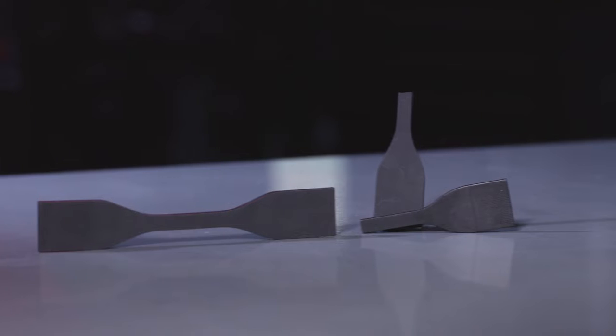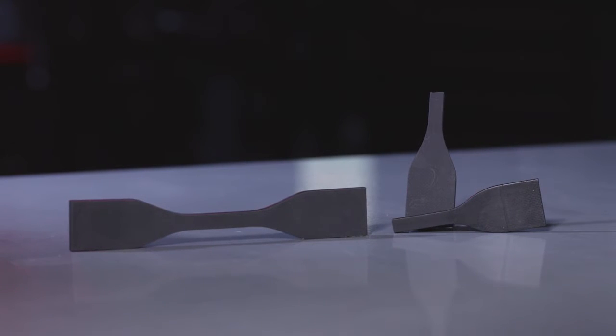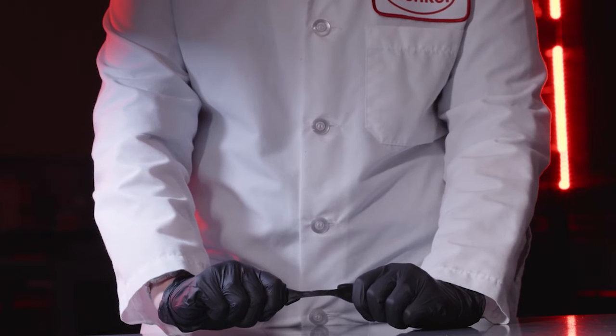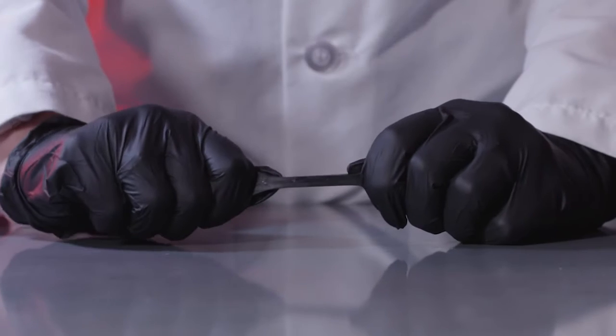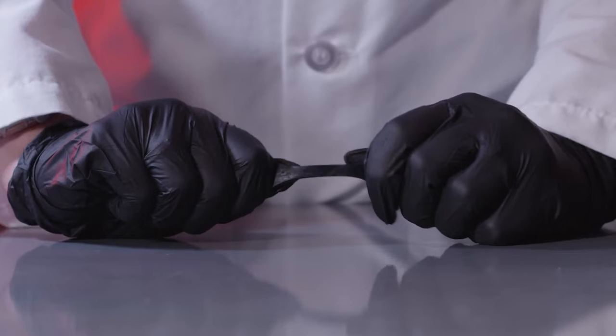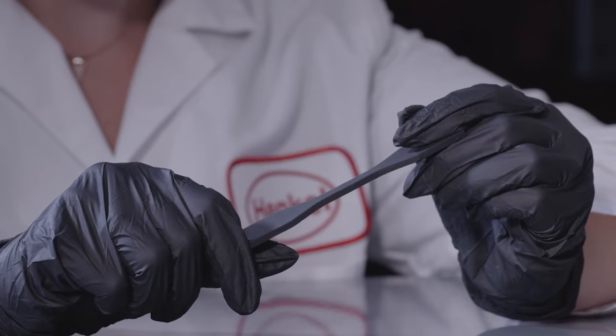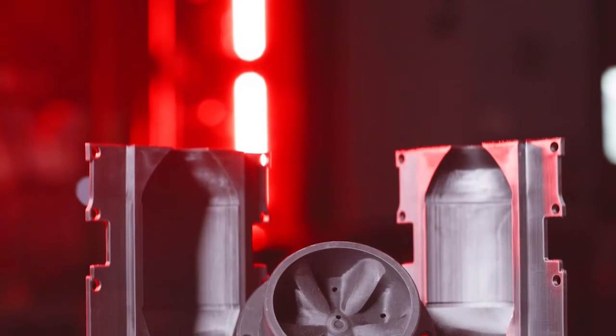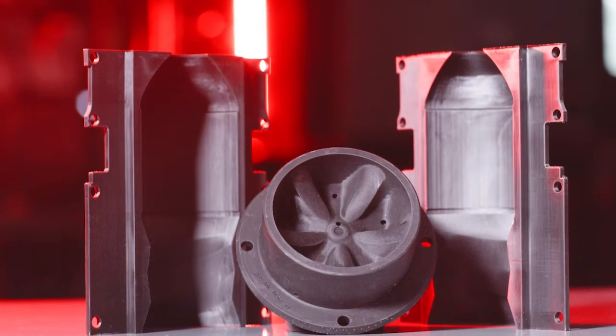When it comes to 3D printing, elongation at break is an important component. Elongation at break measures the quality of 3D printed material by determining how much strain the material can handle before it breaks. This test represents the ratio between changed length and initial length after breakage of the test specimen. It is important to conduct this test to understand at what point the material might fail.